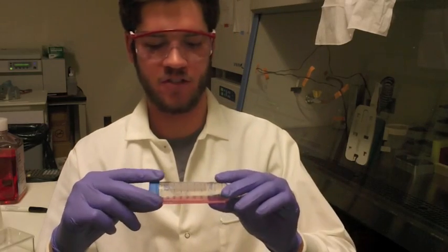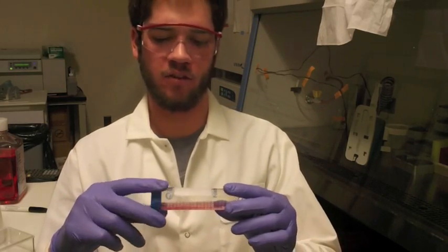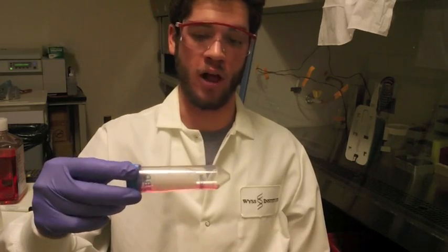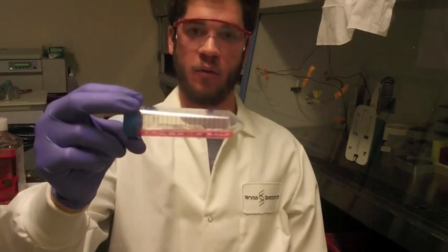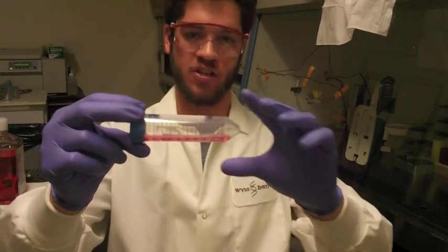So using this feedback loop, the cells could be constantly ready at exactly the density and at full healthy growing state for experiments. And then any time of the day or night when I need it, a researcher can just come in and remove this tube from the actuator and have cells ready to go right here in a usable form already.